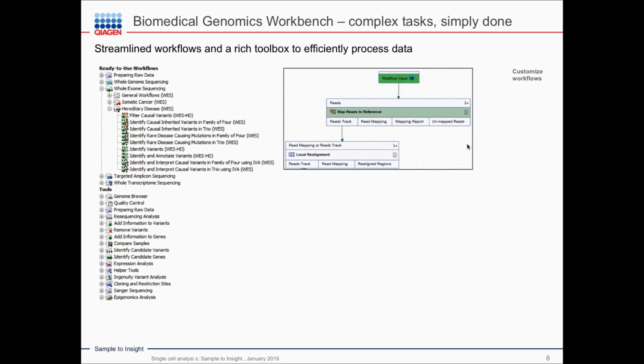The next step in the process, once you've generated your DNA, you've now got genomic DNA at an amplified volume so that you can move forward and target the region that you're most interested in. So this would now be taking over at the point that you would have if you had not had such a precious sample, or if you weren't doing single cell analysis.